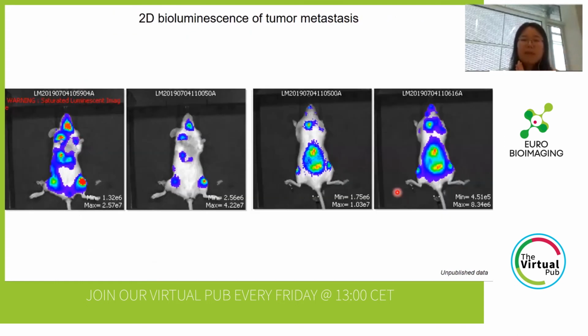In more detail, traditionally people will use bioluminescence to check the inner organ signals, for example here the tumor metastasis. But we know that this method highly depends on the exposure time.